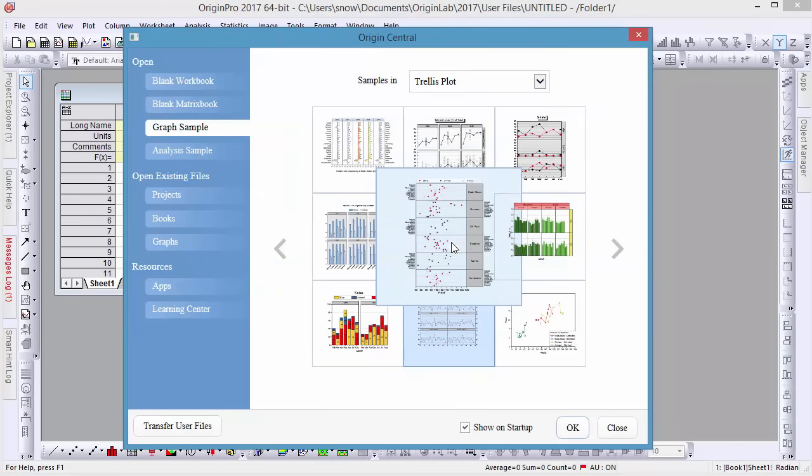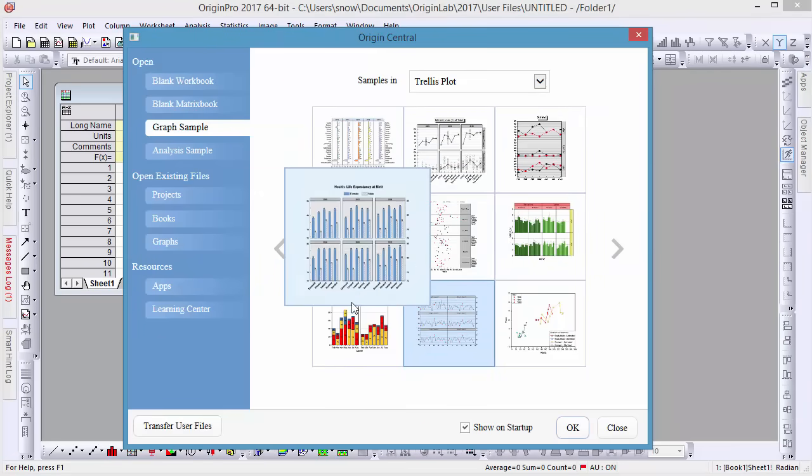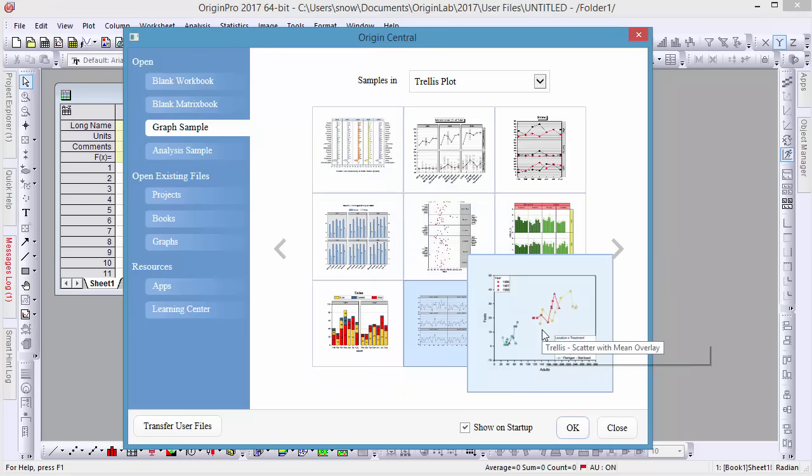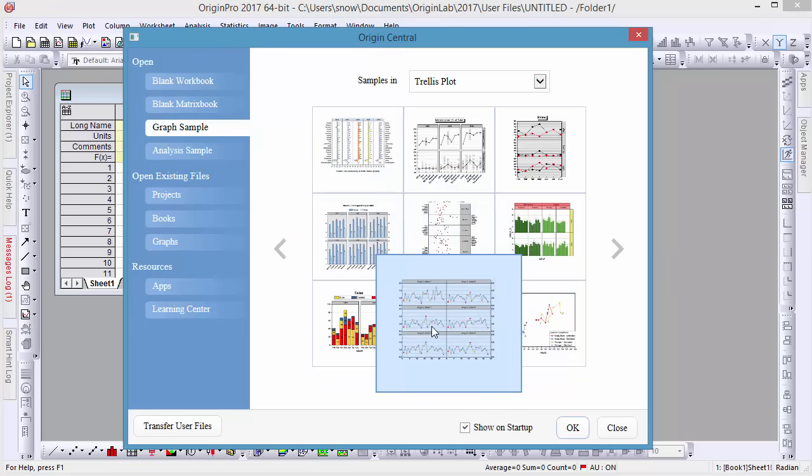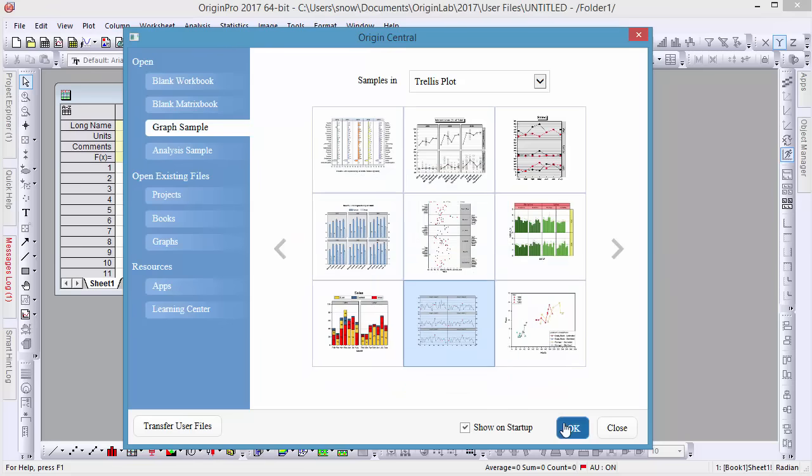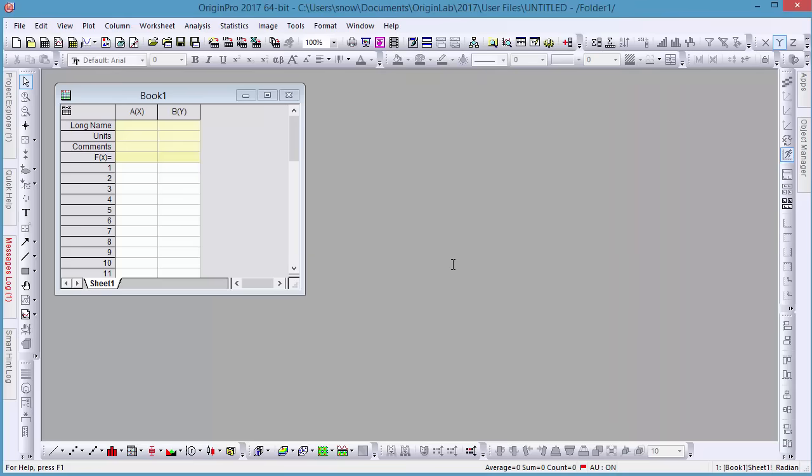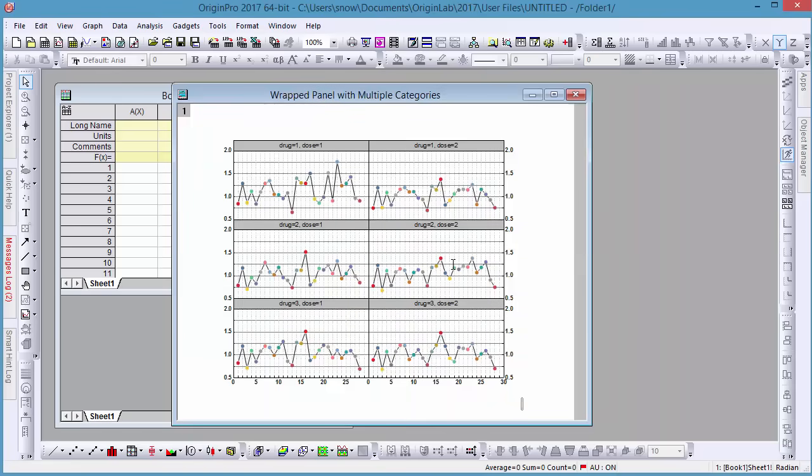Users can easily create multi-paneled line, scatter, and column graphs, as well as multiple combinations of these. Let's look at an example.